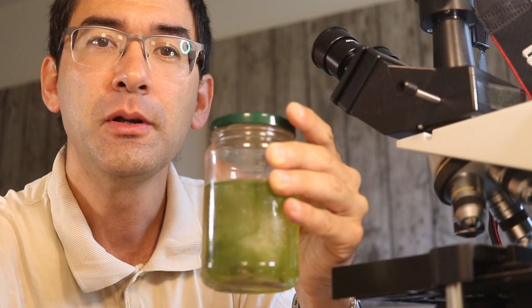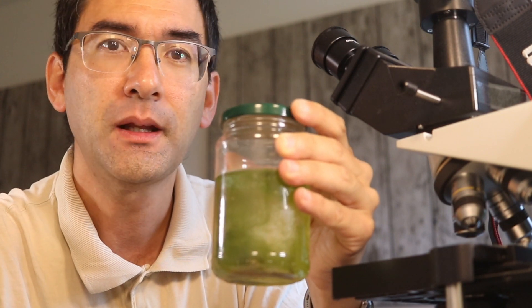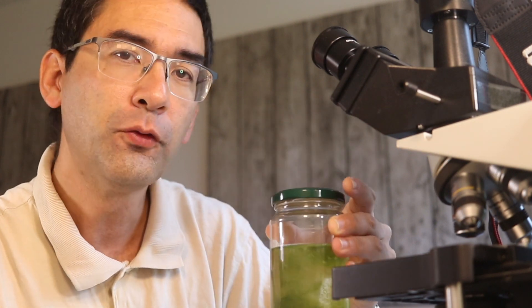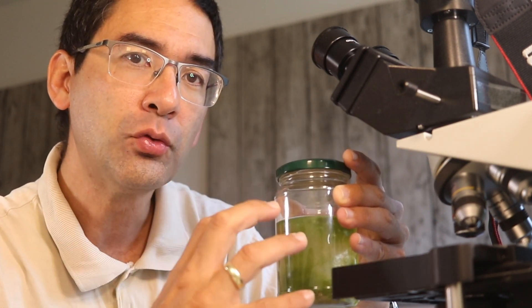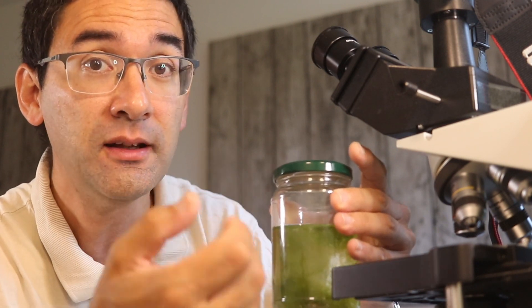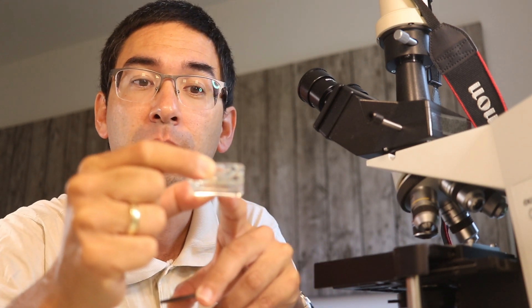In a jar like this, the number and composition of microorganisms will change over time — there's no question about that. This is not a pond. The temperature in your home is different, the light conditions are different, and nutrients are being used up or released. You may see certain larvae start to hatch, giving you different organisms. It will not be stable, and that's expected. If you do manage to completely stabilize a fully closed system, you've accomplished something very difficult.